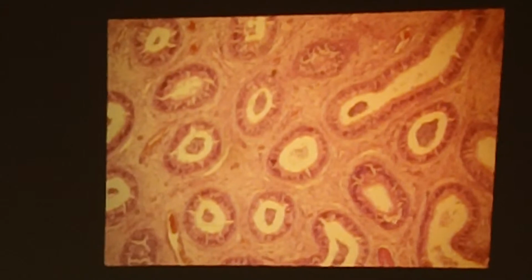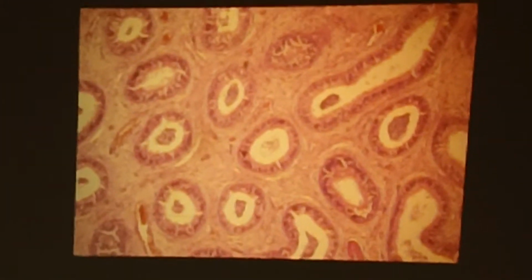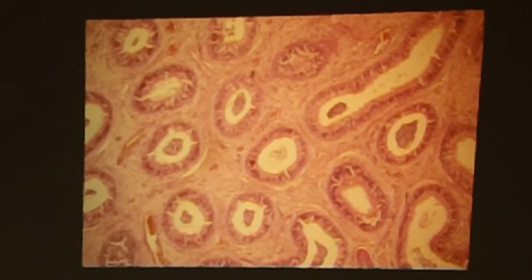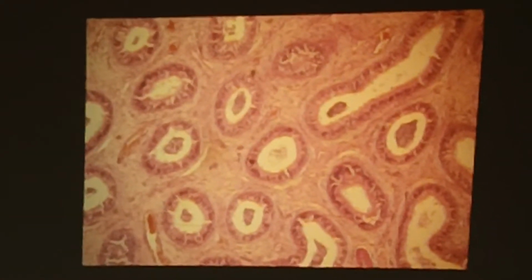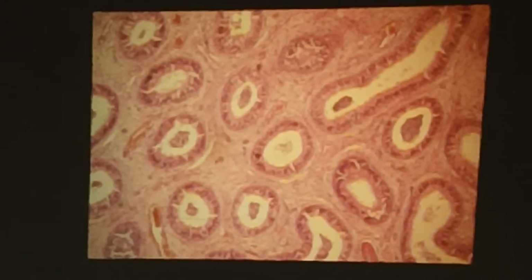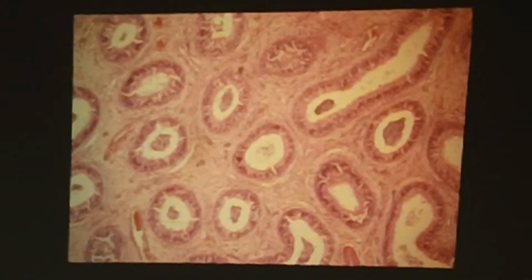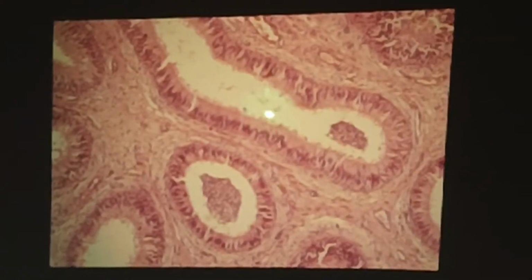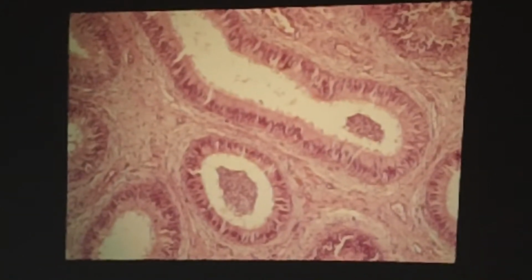Epididymis, as Nigel mentioned, this is a pseudostratified columnar epithelium that is stereociliated. So again, think of stereocilia as non-motile in that they lack the axoneme and the ATPases to drive the movement. But think of it as super long branched microvilli. All right? Same song, second verse, you can see the kind of crew cut of the stereocilia right here.